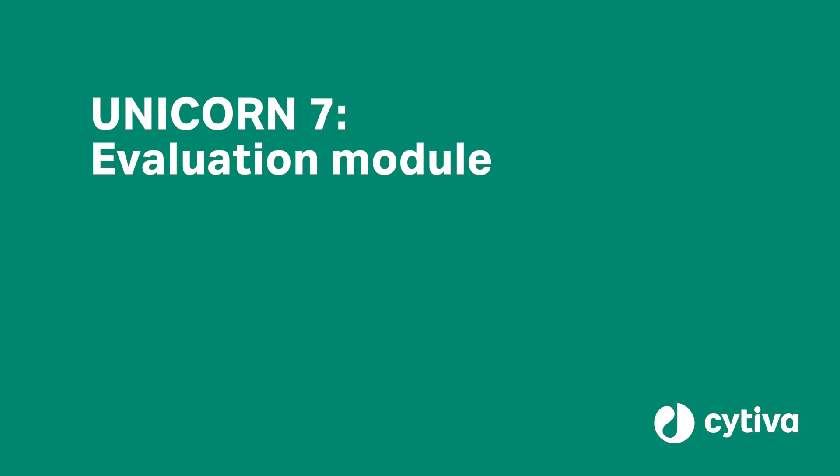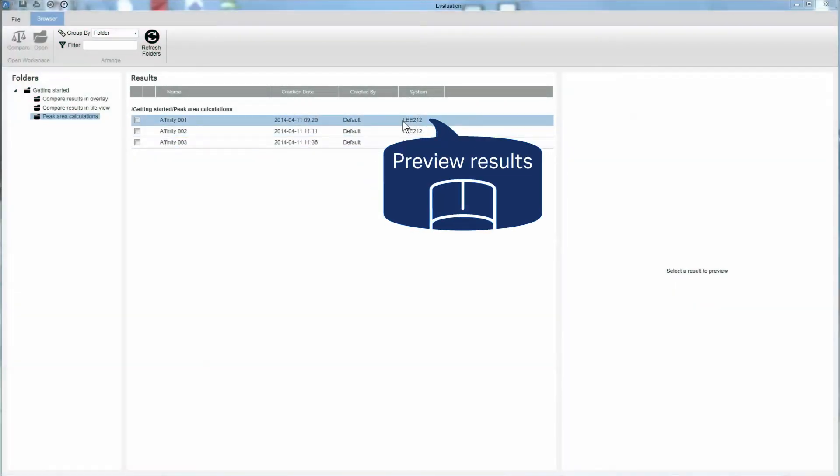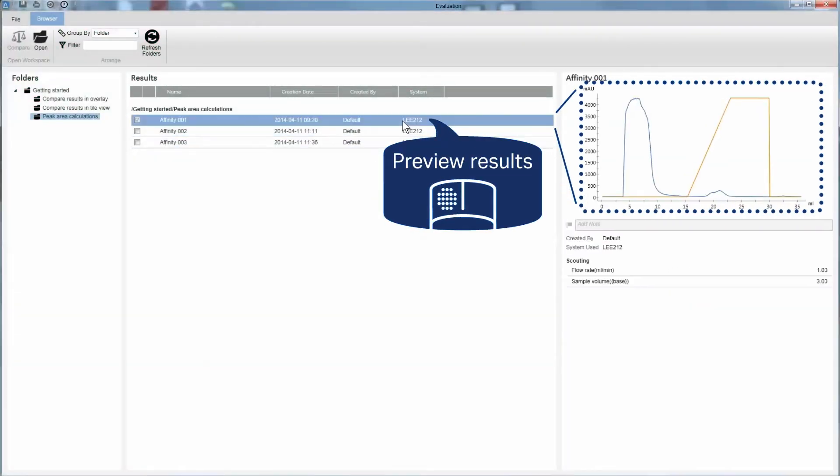The Unicorn7 software lets you perform peak area calculations in a few simple steps. Start by accessing the results overview in the preview pane.